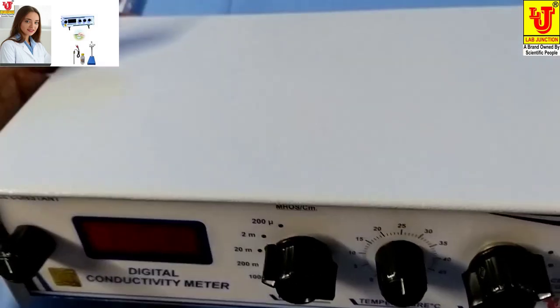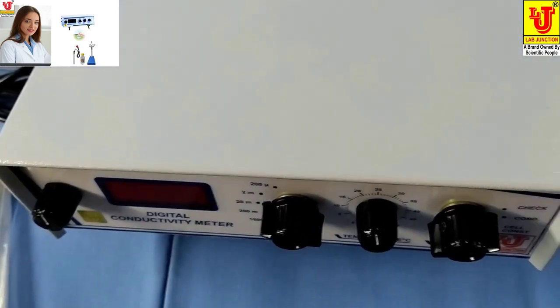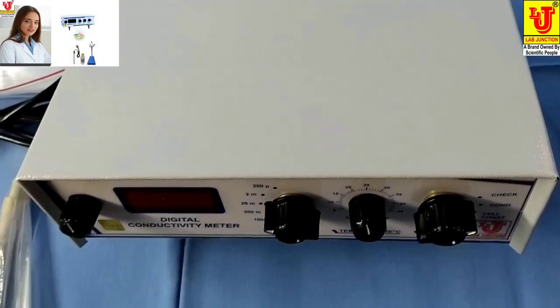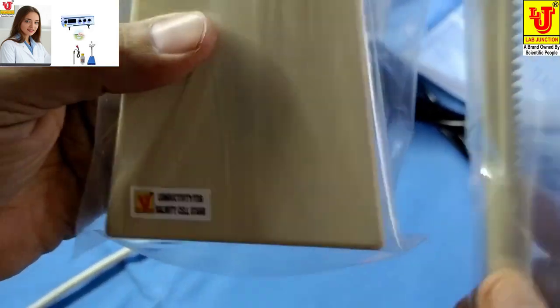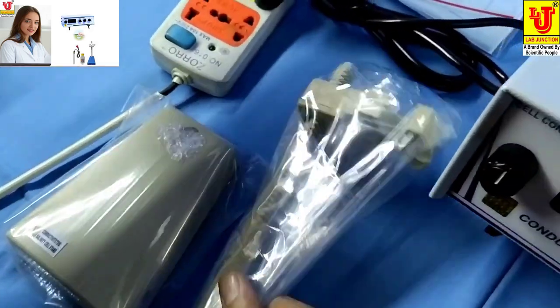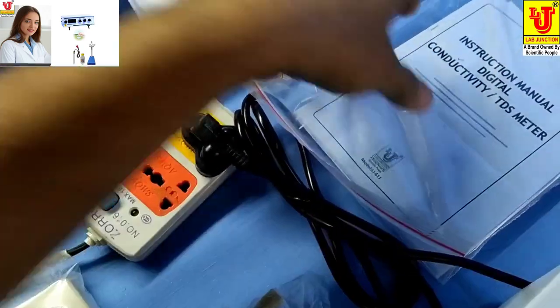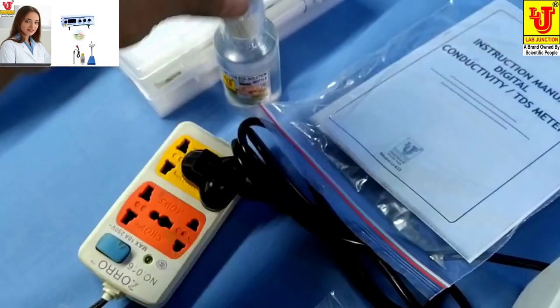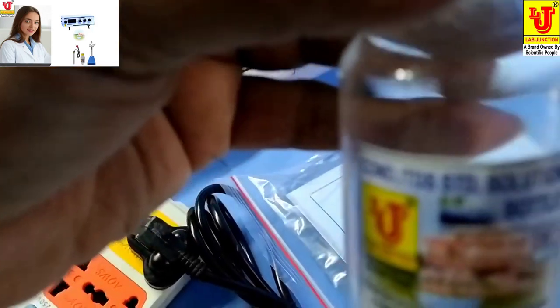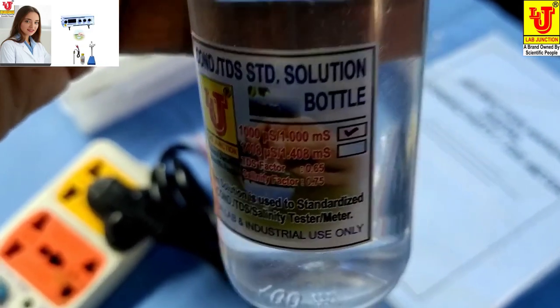Now I am switching. We have supplied accessories with this. One is Conductivity Cell Stand, Conductivity Cell, Instruction Manual, Dust Cover, Warranty Card, and one is Conductivity Solution of 1 Millisiemens.